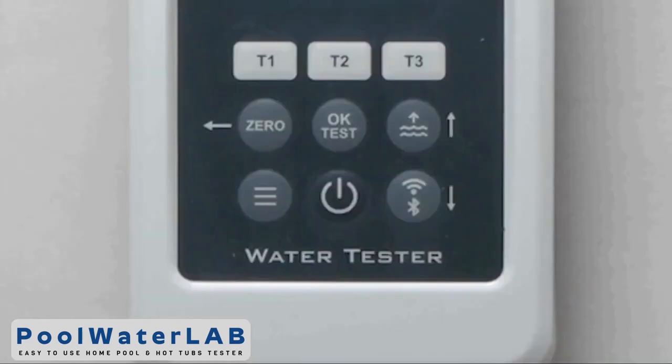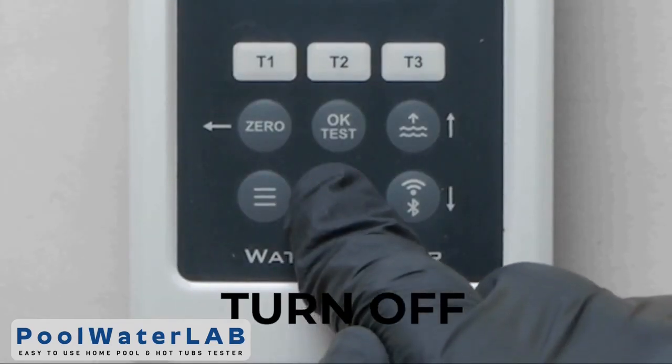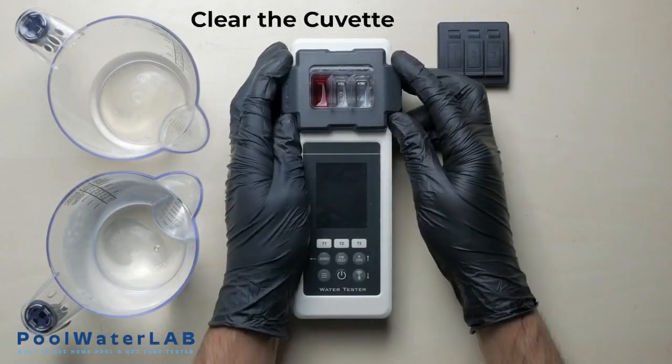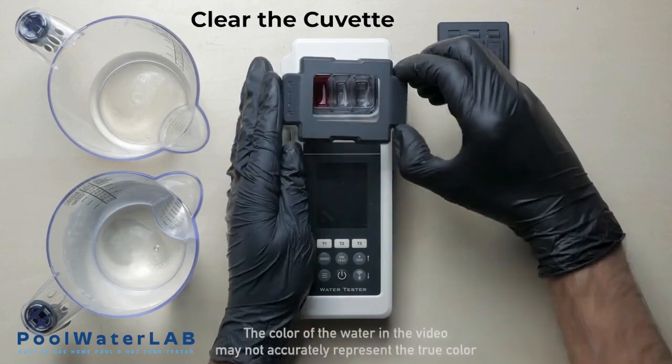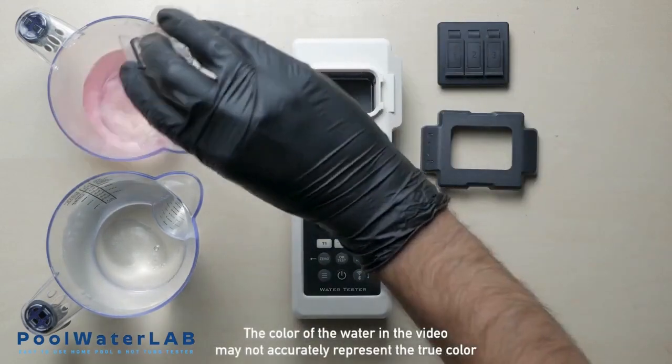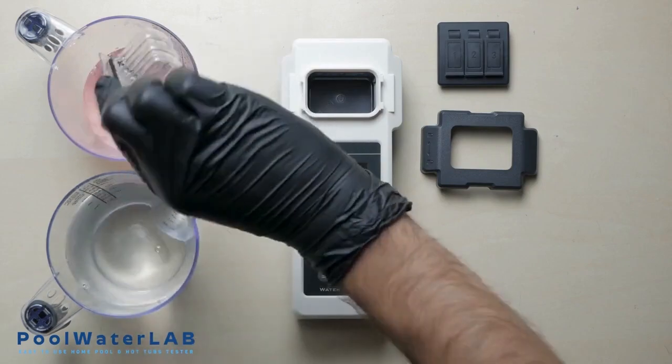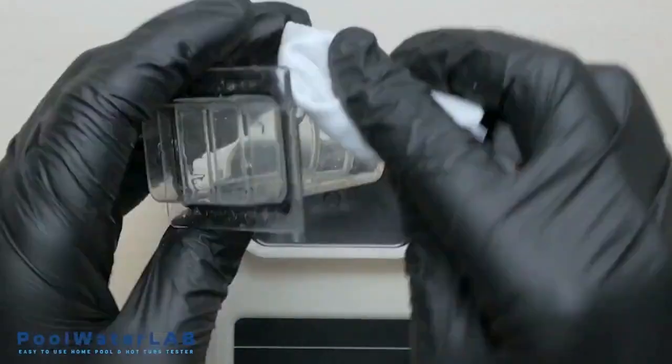Turn off the device by pressing and holding the off button. Run other tests if necessary. After completing the tests, obligatorily rinse the cuvette with clean water and prepare your tester for the next measurement. Wipe the cuvette dry with a clean cloth.